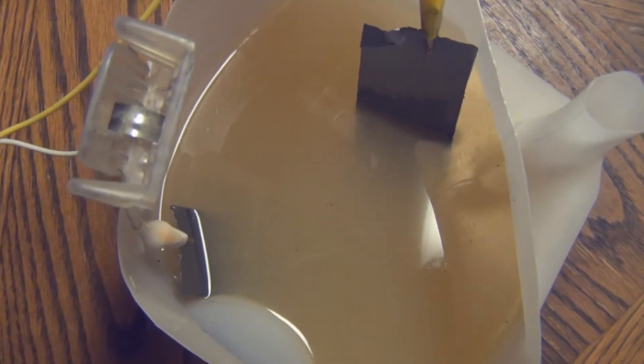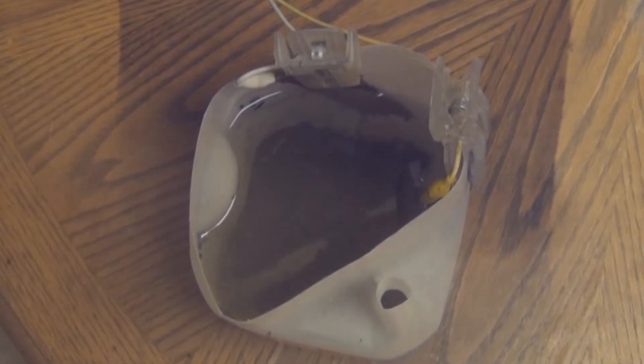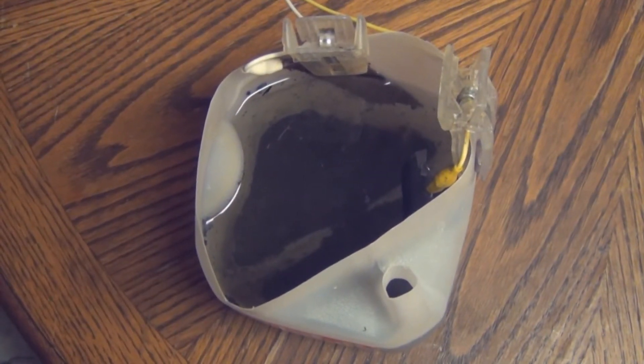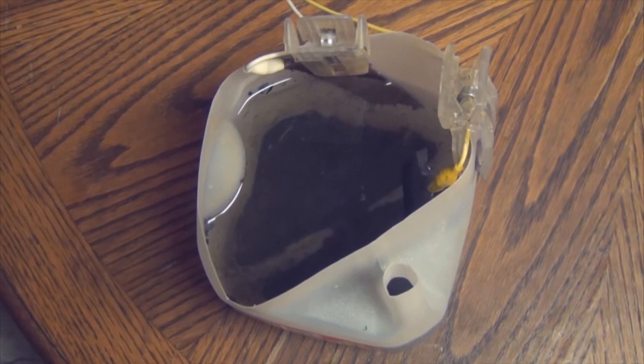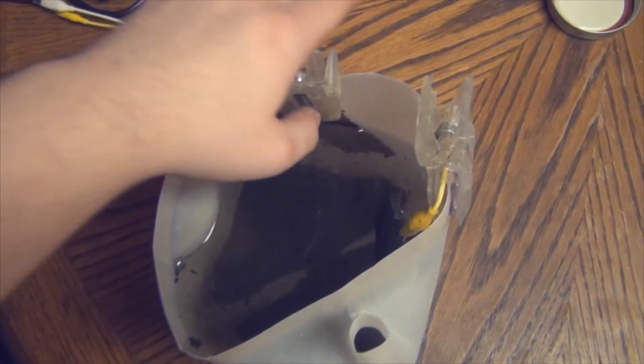You'll see graphite nano platelets forming at the top of the liquid — there's some foaming and fuming, and those little black specks are graphite nanoparticles. This took about 12 hours to complete. When you come back you should see a bunch of black material at the bottom. Unplug everything and remove the electrodes.